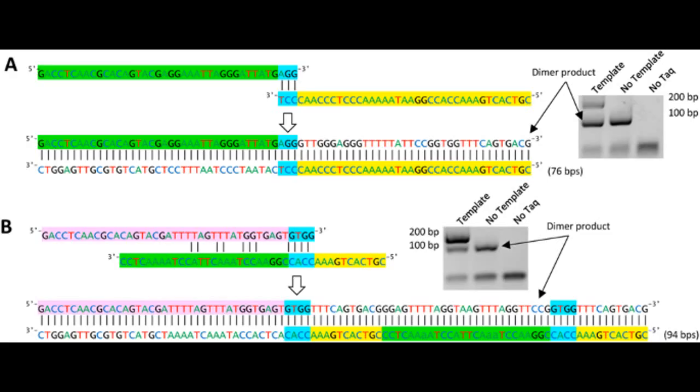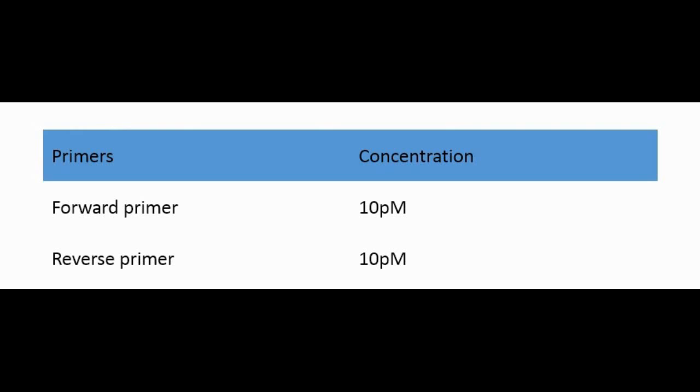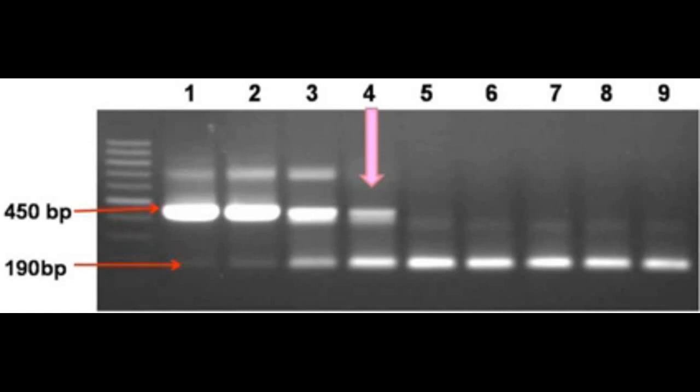Secret 5: The Concentration of the Primers. Stock primers are supplied at various concentrations, and we have to decide which works best for our PCR reaction. If the primer concentration is too high, primer dimers and nonspecific amplification occur. If it is too low, the DNA of interest cannot be amplified. The ideal concentration is 10 picomoles for both reverse and forward primers. Still, you have to optimize your own primer concentration using a gradient PCR machine.